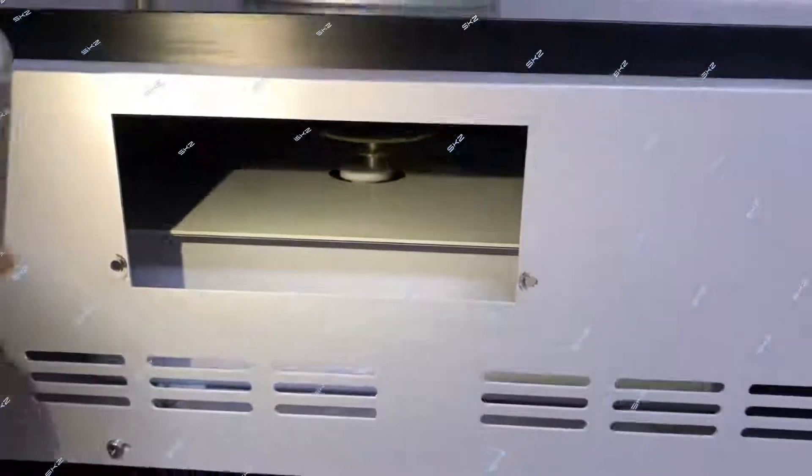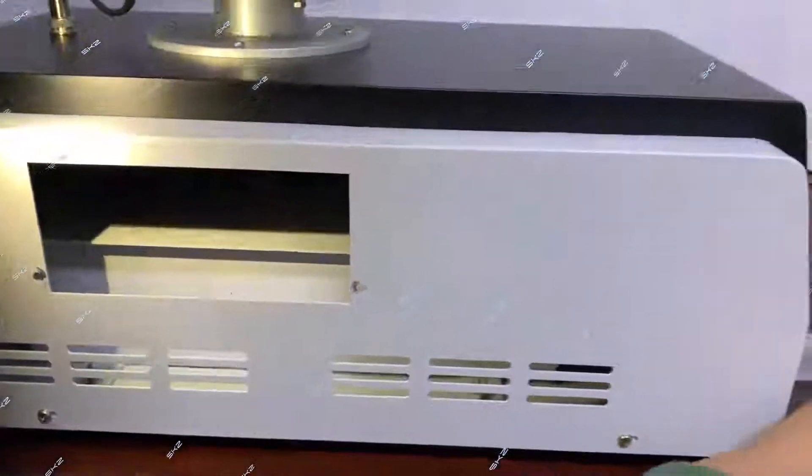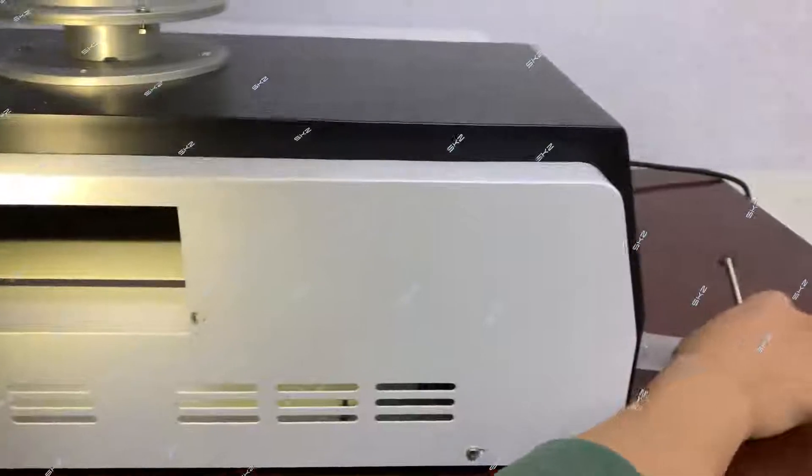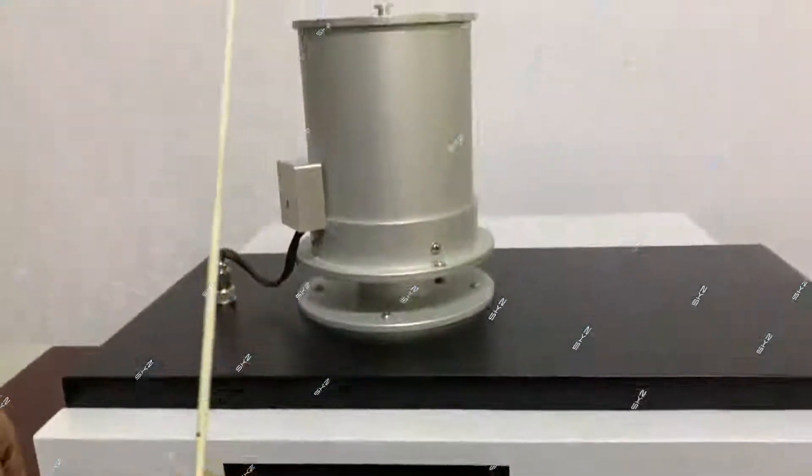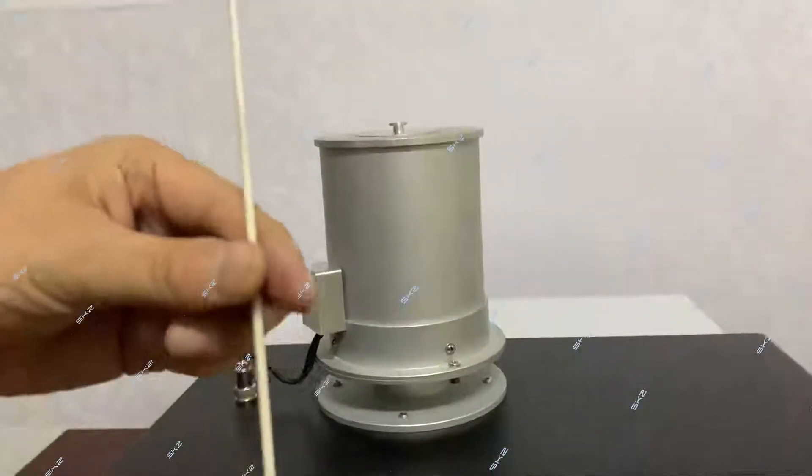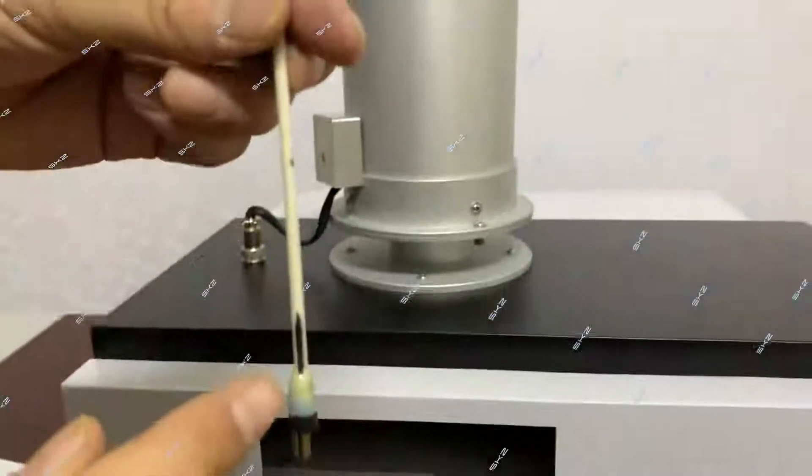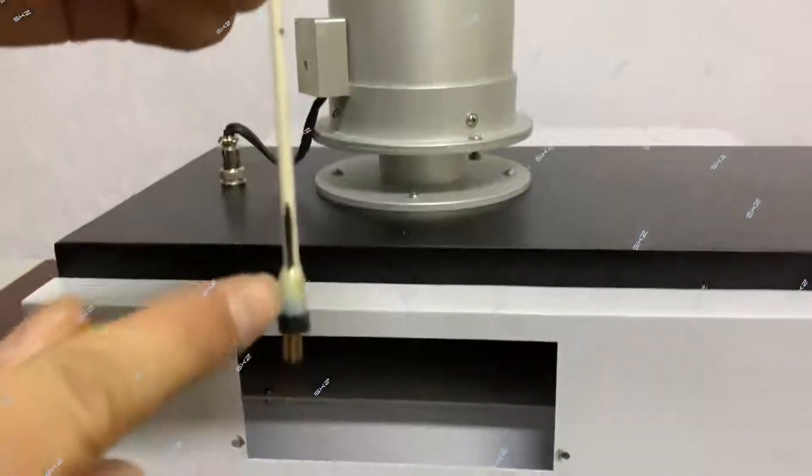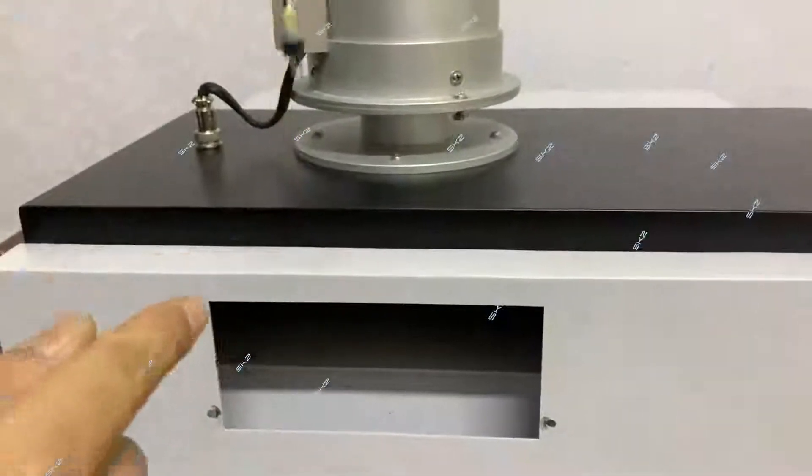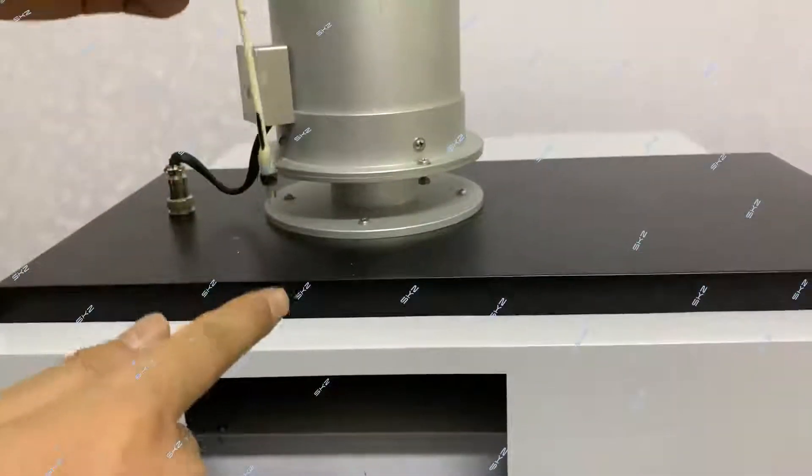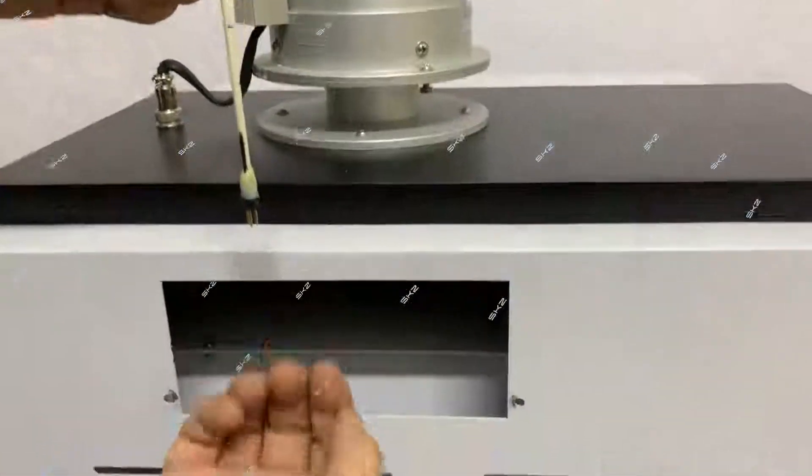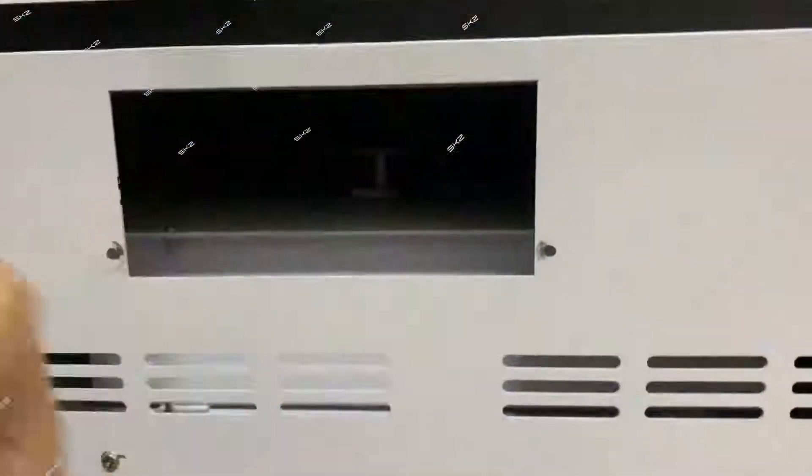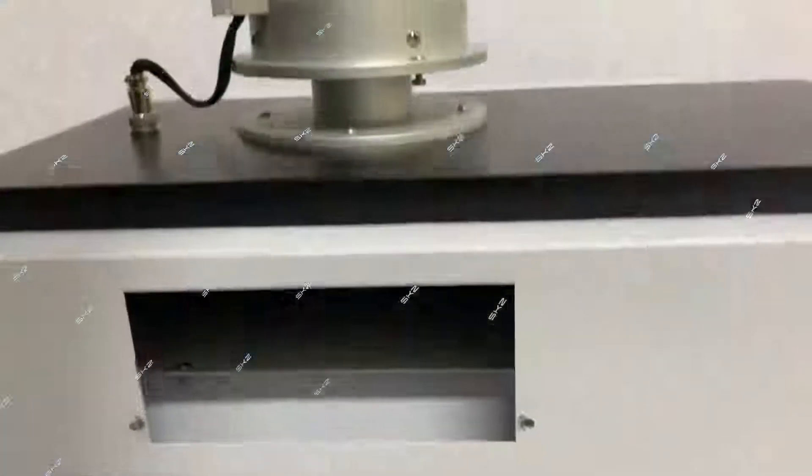Then we put the sensor. You see the sensor here has the black mark. The black mark will face forward, this window, this side.